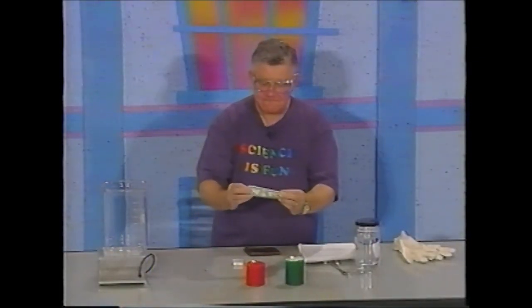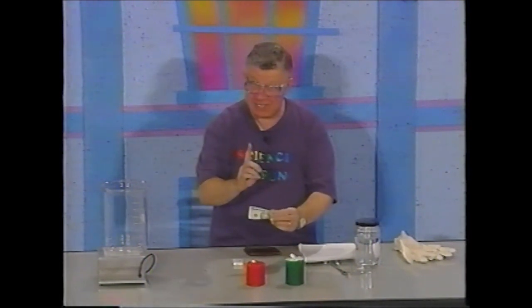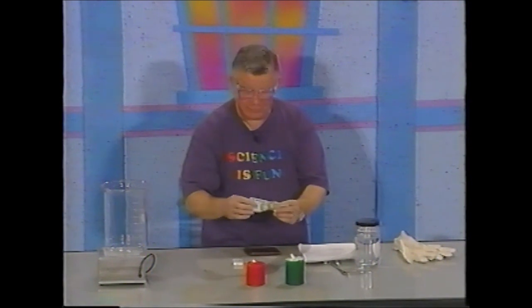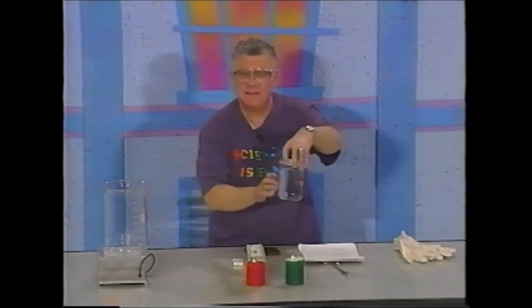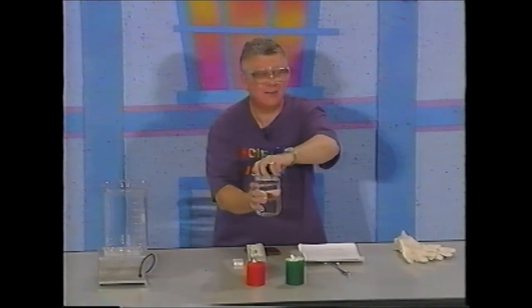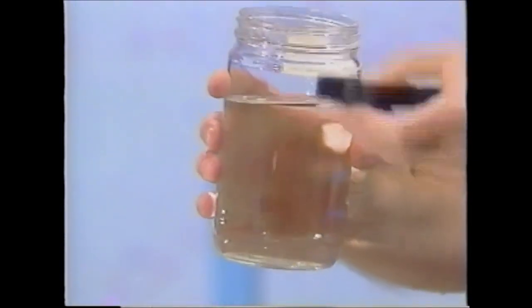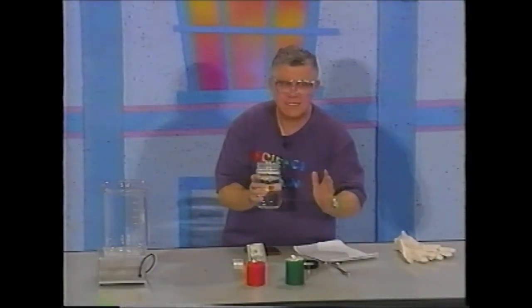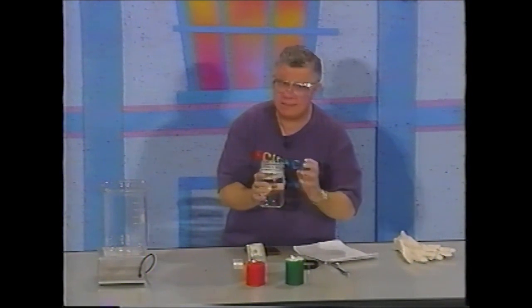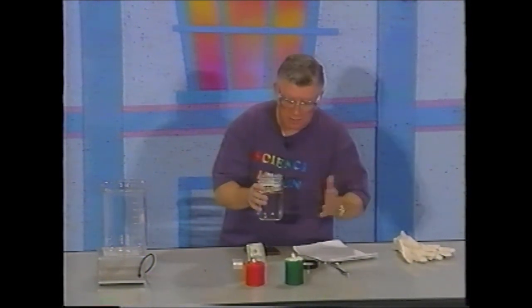Well, in my lab we do lots of fun things, but we do them obeying the safety rules. So what I'm going to do is take this jar that has in it a clear and colorless liquid. What does it look like? Water. Looks like water. Again, you say water from experience. This liquid, we describe it as being a clear and colorless liquid, as is water.